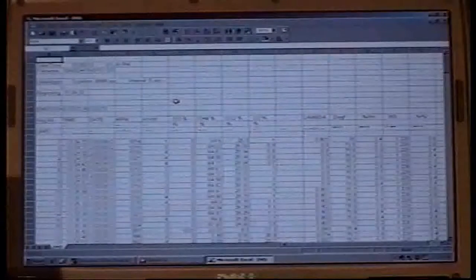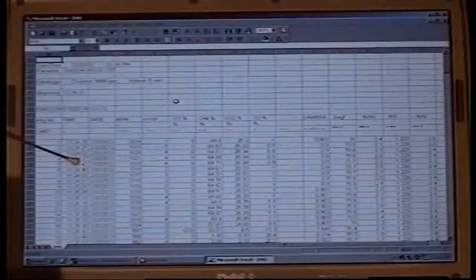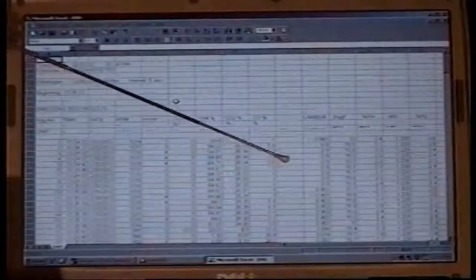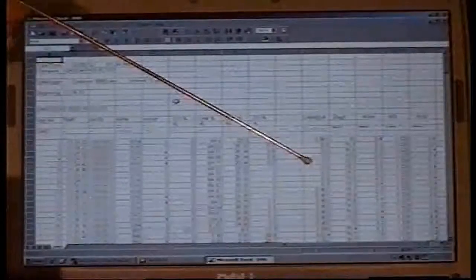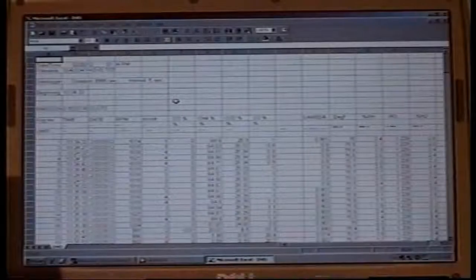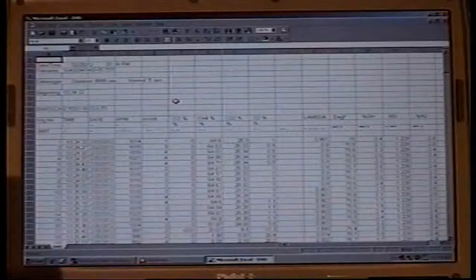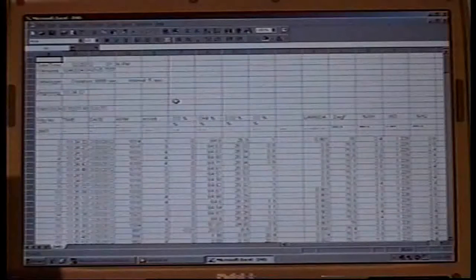There's our Excel display. We have a time and date stamp for each entry. We have our gases through here, and over to this side we have the information from our expansion ports. This will give us our light level and our temperature and the voltage on that battery, or whatever sensor we happen to have on there. Again, if you save two files by the same name, they're not going to destroy one another, so the files are appended to one another.